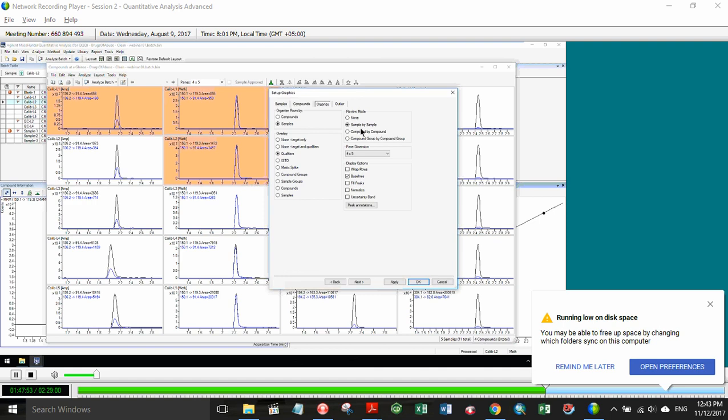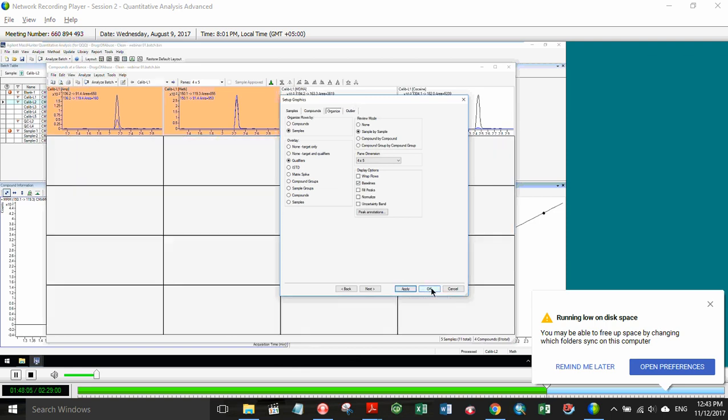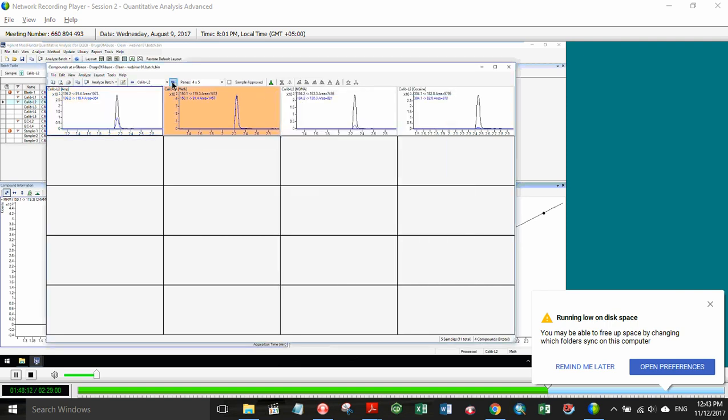Another nice thing, I found this while preparing for the last talk. For the sample by sample mode, this goes along with the idea of the sample approved box. Once again, we get our blue arrows here. Blue is going to cycle us, in this case, through our different standards. We've also got the drop down.